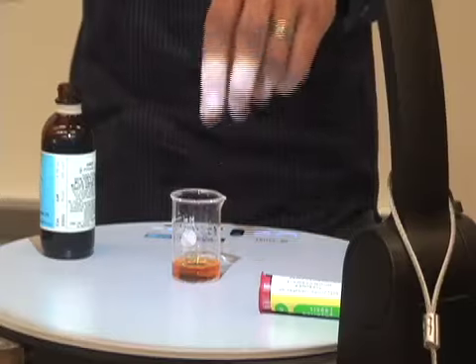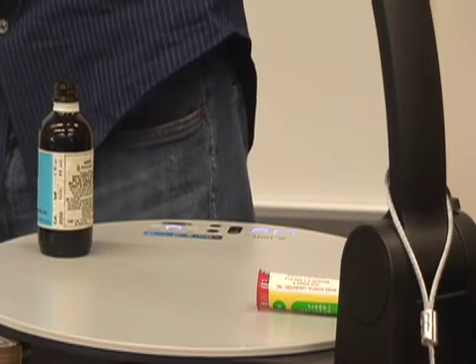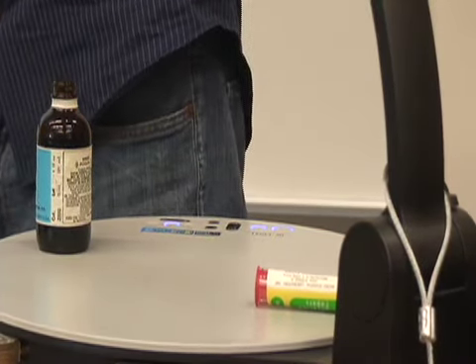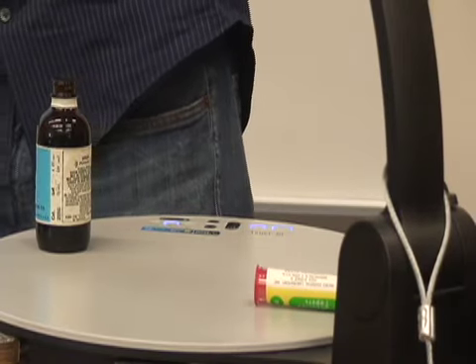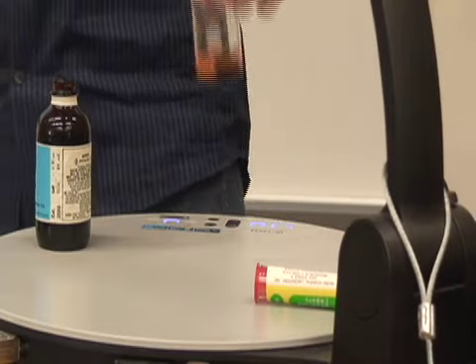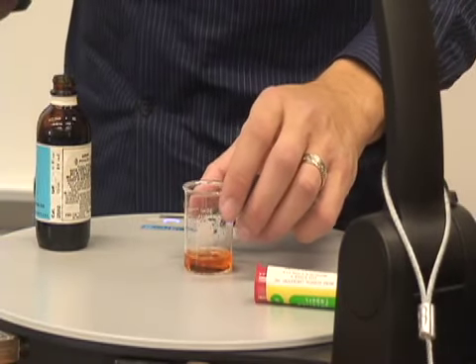Wow. So you saw that its original color was pretty much yellow, right? Yellow green. That showed a pH of 7. Now what is the pH? Closer to 3. Yeah, closer to between 3 and 5.